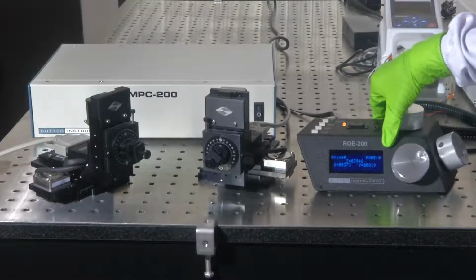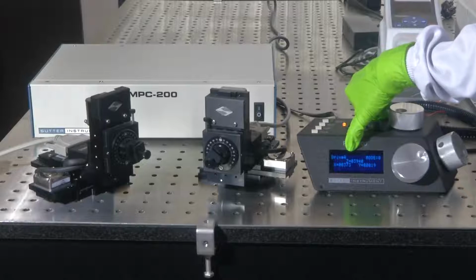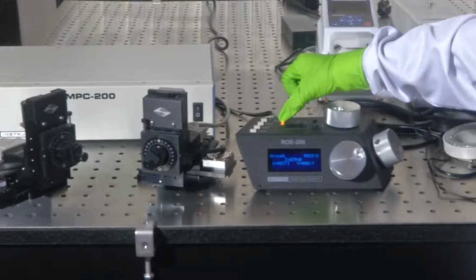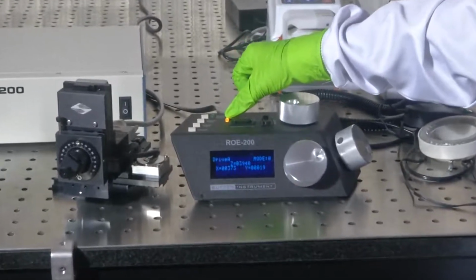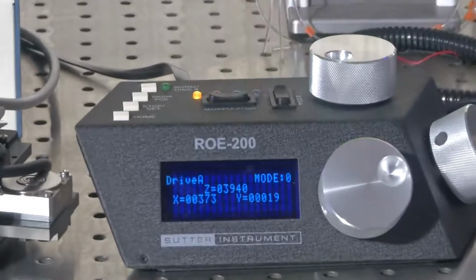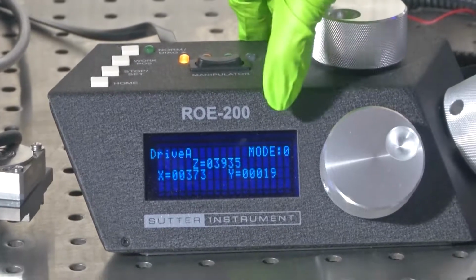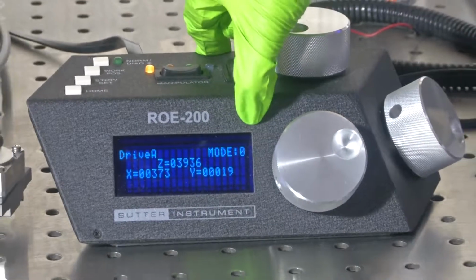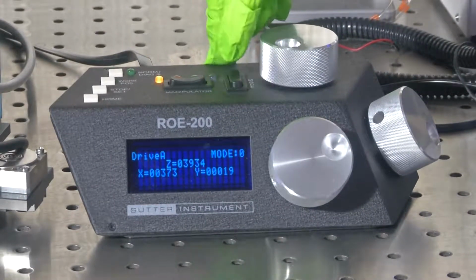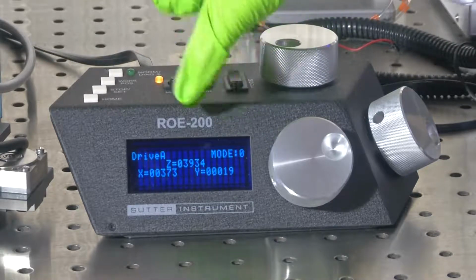and what you can see is drive A, which shows that it is set to manipulator A. The LED here also indicates that the current working manipulator is the first, which is nothing but A, and then mode 0. Let me explain more about mode, and you could see in real how you could manipulate the relation between the physical rotation and the amount of displacement.